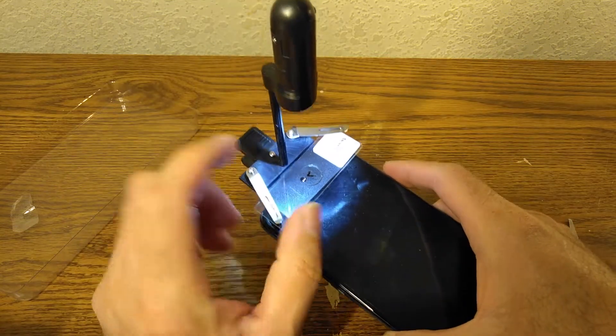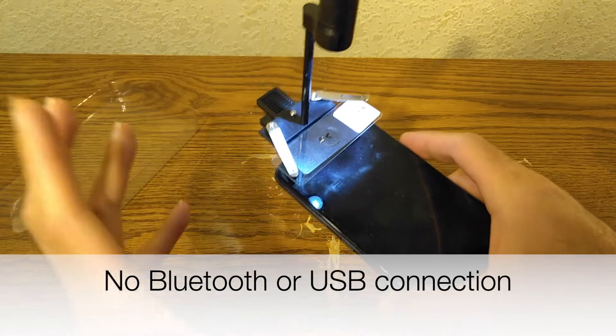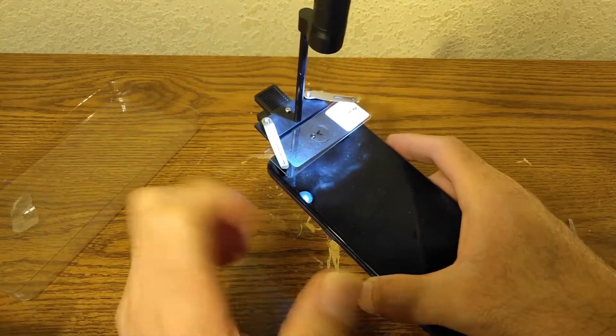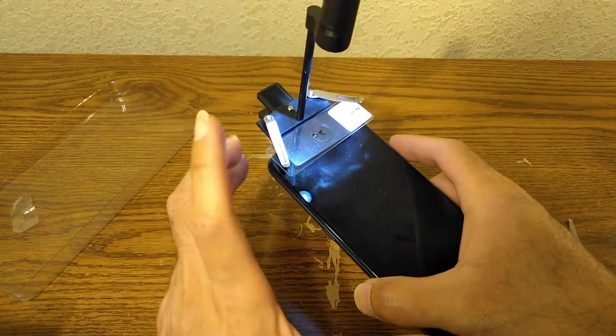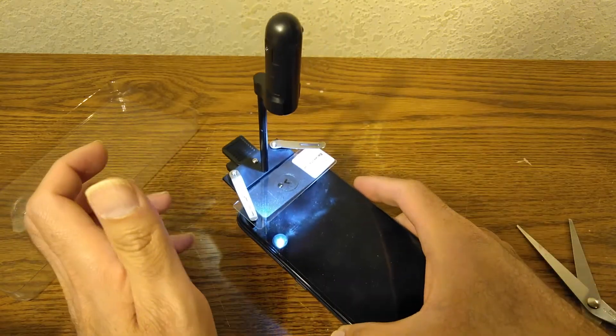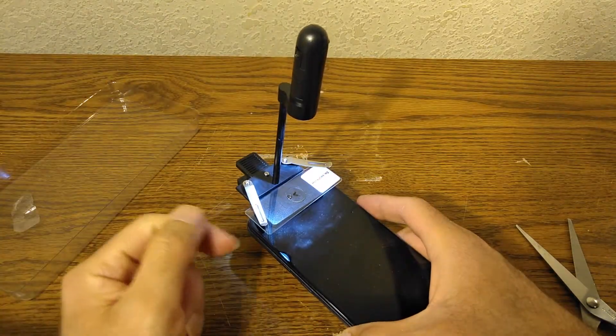Basically there is no connection between this and the phone — there's no app, you don't need any wires, you don't need any Bluetooth connection. You can use any phone; it's compatible with all phones from any era, as long as they have a good front camera it'll come out perfect. Let's move on and see what the slide looks like.